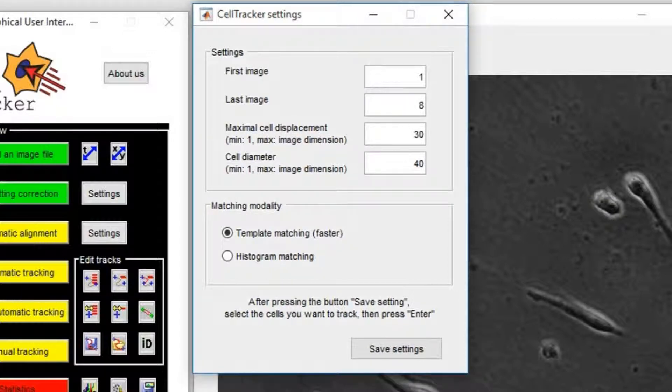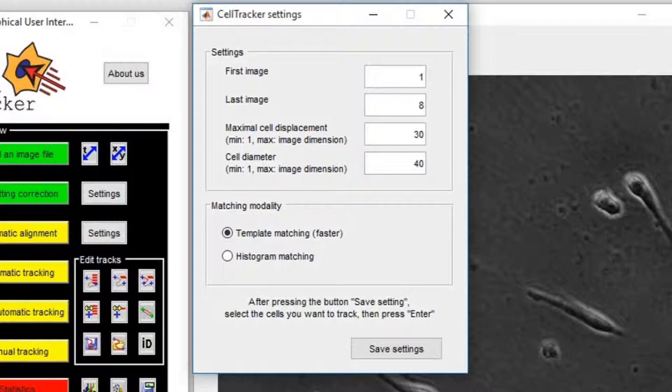Two different matching modalities are provided to find the correspondence of a cell in the following frames. Template matching is the default and it is the fastest. A rectangular template will be automatically defined around the cell and the position of that cell in the next frame will be defined looking for the best template correlation.